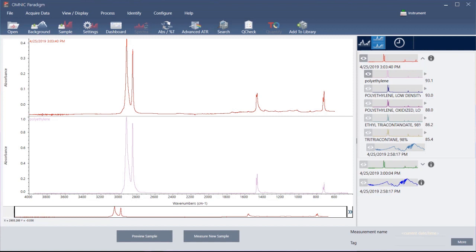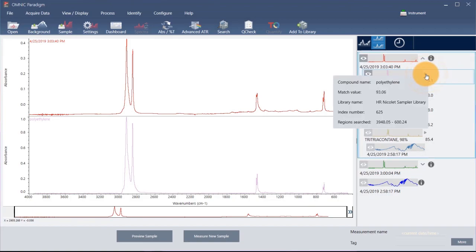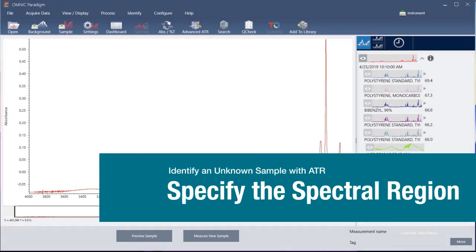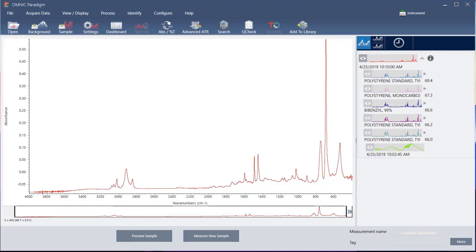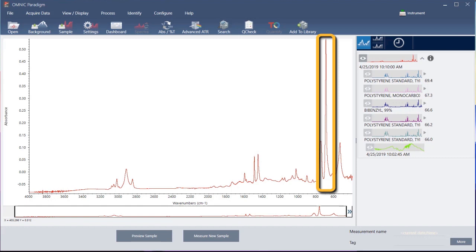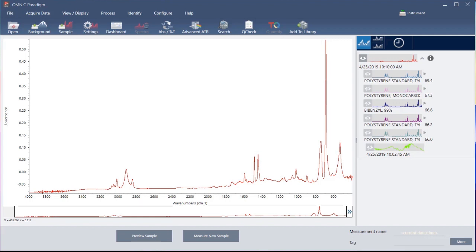To get more information about a spectrum in the match list, including the library it came from and its identification number, click here. If your sample spectrum has a peak that is so large it is off the y-axis scale, you may want to exclude that peak from your analysis. These flat-top peaks are referred to as totally absorbing and can contain excessive spectral noise, which affects the analysis results.